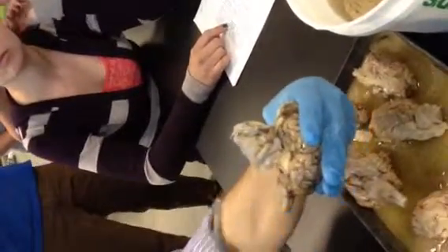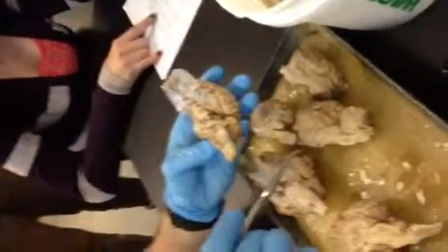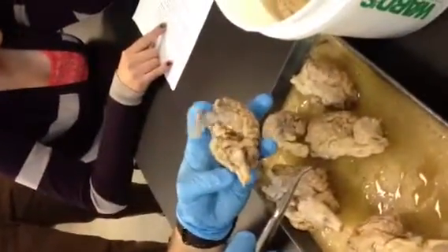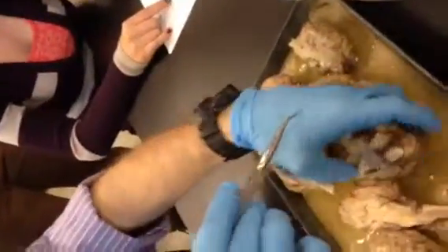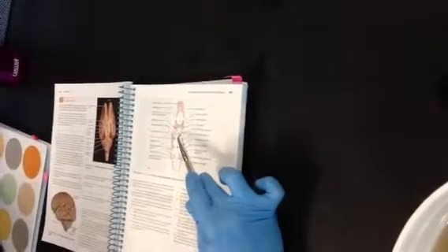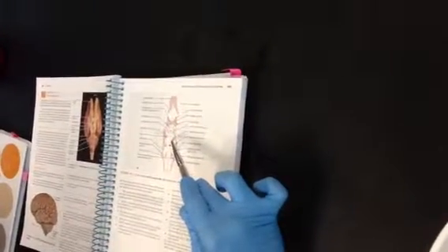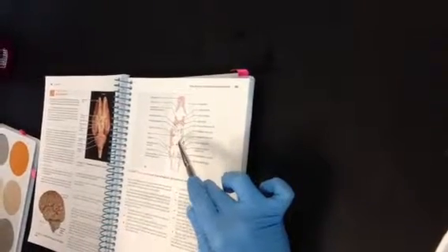Peduncle there, peduncle there. Oculomotor nerve. All right, oculomotor nerve is going to be number 3, and as I said before, we will not do it off the sheep brain, but we'll do it over here. So this is 1, 2, 3, oculomotor. 4 is trochlear. We will learn these next day and next time in lecture. This is 4. That's trochlear.